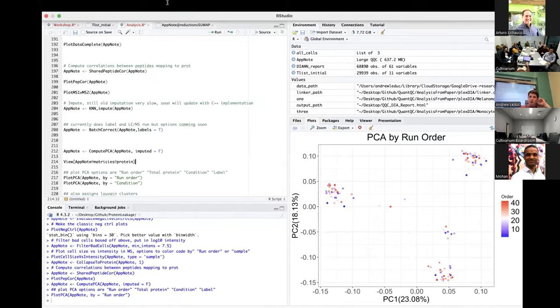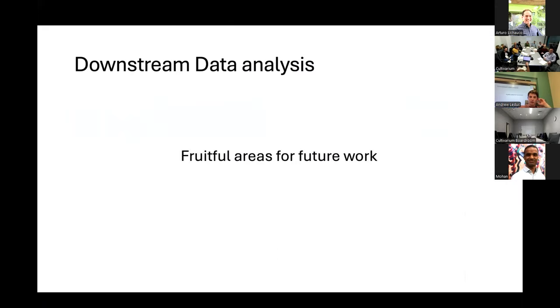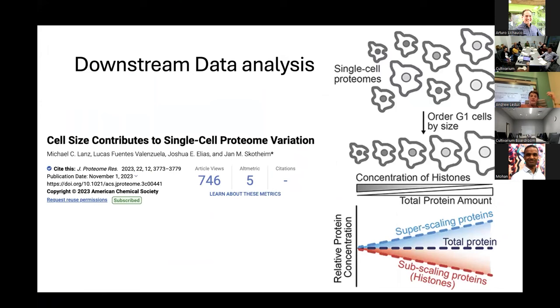And just to wrap up here, I know it's been a long day. I only have a couple more slides. As I said, this normalization of cell size by the median intensity of the cell is not perfect. There's no perfect normalization, unless you exhaustively explained every situation in all of its context.